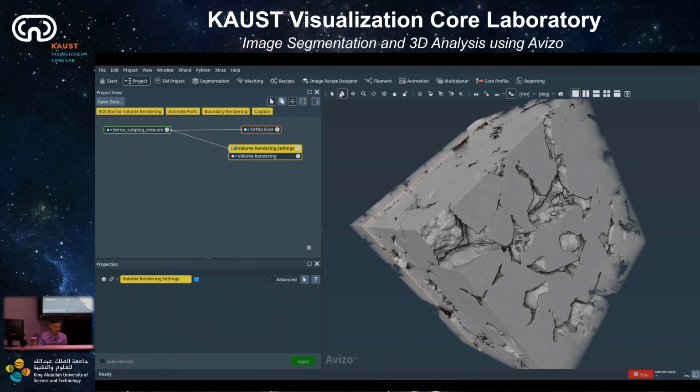That's why we need to get used to changing between the hand trackball tool and the arrow, the interact tool. When you hover the mouse over this tool, we have the shortcut. For example, here the shortcut is the escape key to change between these two. If you click escape, you can see it changes between arrow and trackball tool easily.